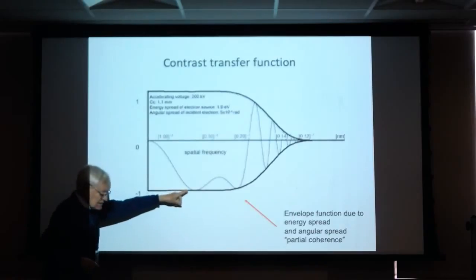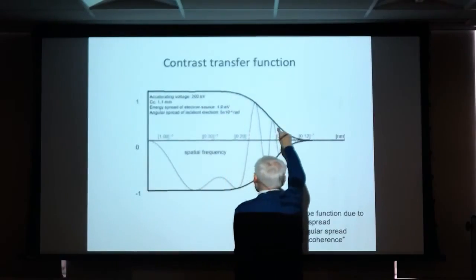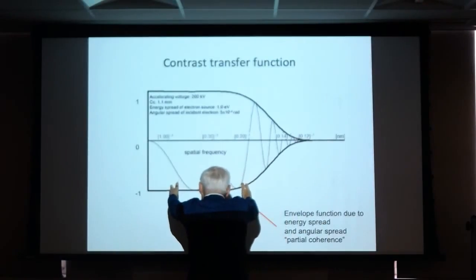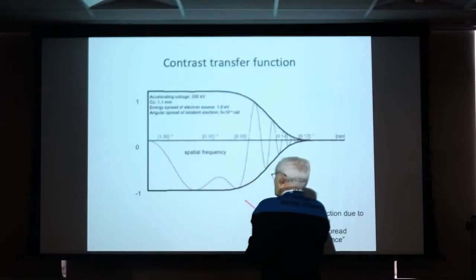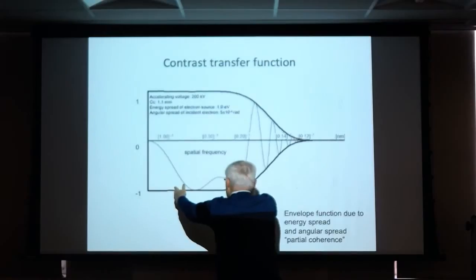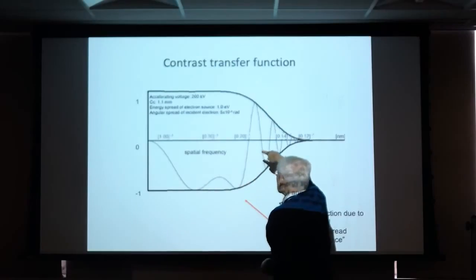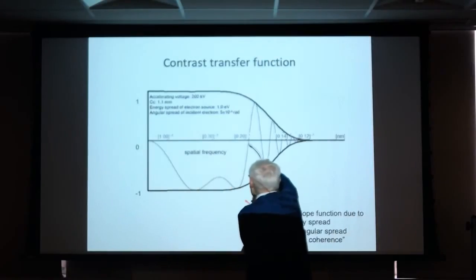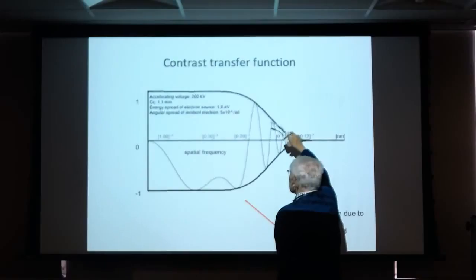Then it reaches the maximum and is doing some wiggles here. Then it oscillates back and forth. Essentially, we have one portion here, a band of contrast with essentially the same weight, but then it's followed by a rapidly oscillating curve, which means that we have no information whatsoever at those zero crossings. Then in between we have a positive contrast, negative contrast, and so forth.